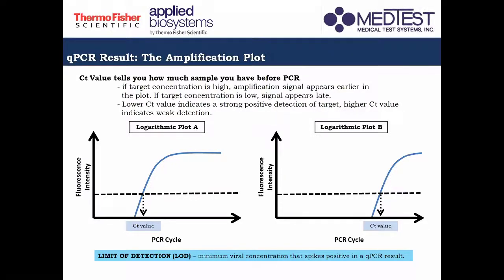Okay? But pag konti lang yung DNA na nandun sa samples nyo, then your curve will appear at a later stage or at later cycles of your PCR. No?